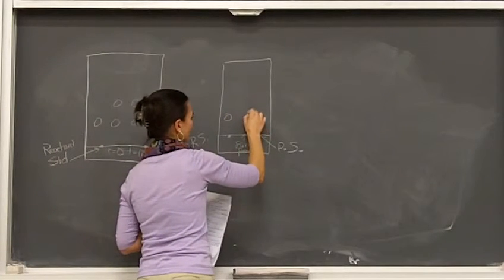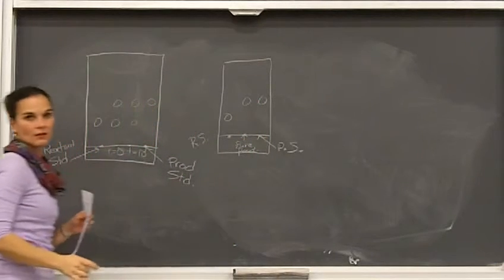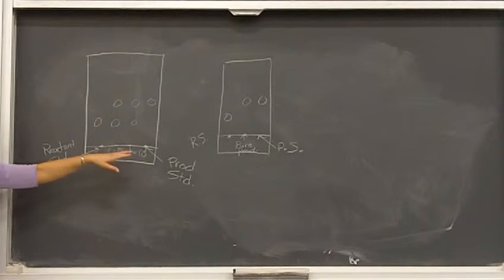Ideally, with the pure product, you want to get to where you don't have any starting material in there. All right, so that's what you want to see when you get to the end.